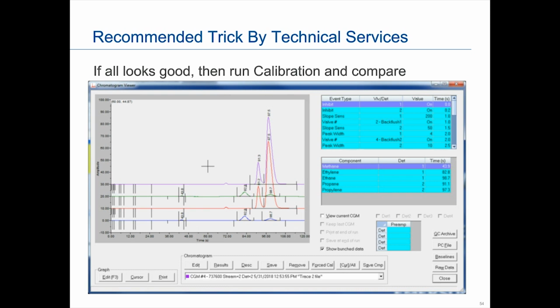And the reason they do that is that the liquid standard is, A, expensive, and two, there's not a lot of it, so they don't want to keep running calibration streams where you're doing the 3 and 2 and the purging if they don't have a high probability of passing calibration.